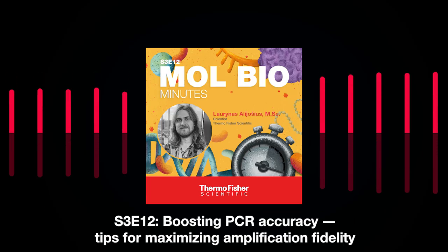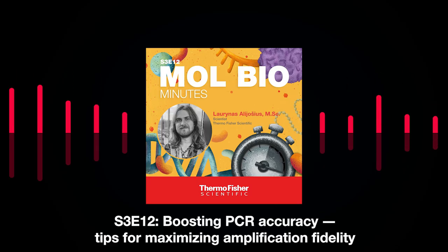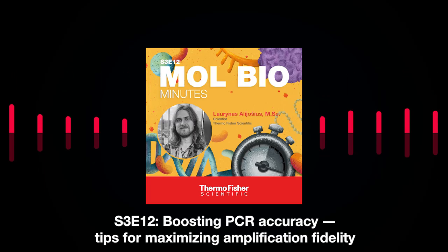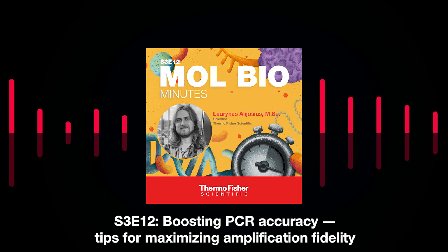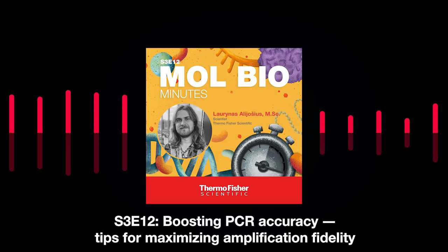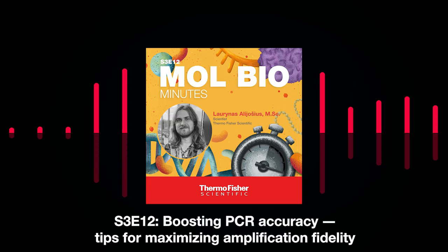Magnesium ions are essential for your PCR reaction to happen. But if you have too high concentration of magnesium ions, that can negatively affect the accuracy. And there are some other ions that are called similarly, but not the same. These are manganese ions. Oh, you want to avoid these manganese ions because they can increase your polymerase error rate in a bad way. So you want to avoid that.